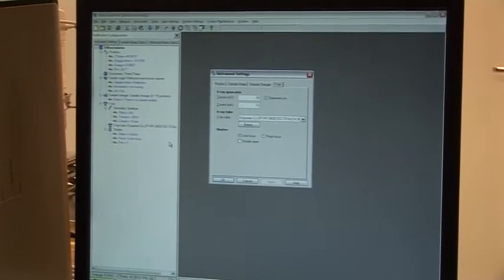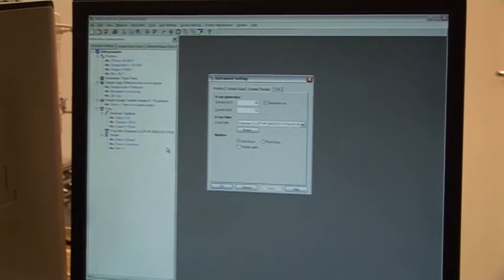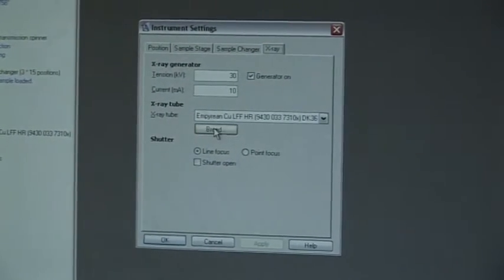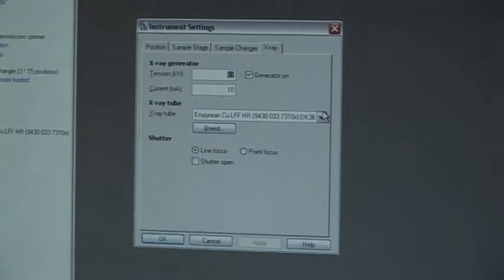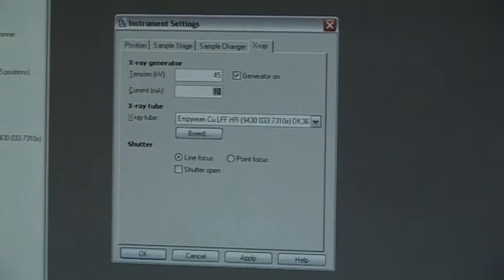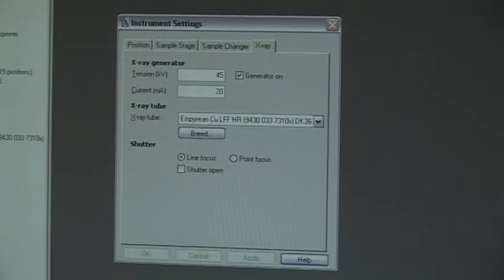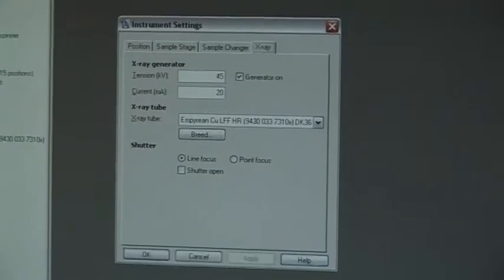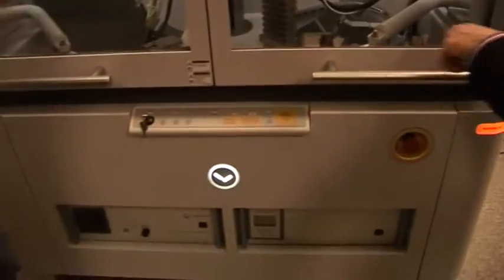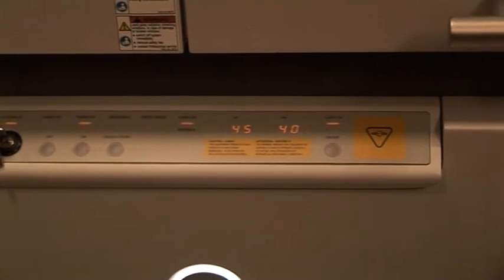In order to get specific X-rays you have to have specific settings on the X-ray tube. If it's a bit too low, for instance tension and current, then you never get characteristic X-rays, you always get this background radiation. 30 and 10 are standby values when the tube is not used, and then we don't produce any K-alpha radiation. Operating conditions are 45-40, so 45 kV and then 40 mA for this particular tube. I usually go stepwise from 45-20 to 45-40. You can see these numbers are changing.